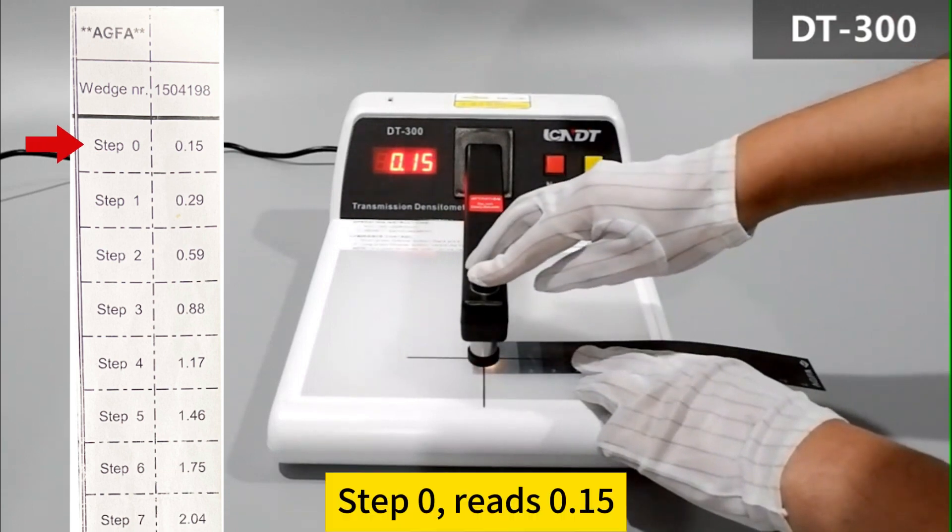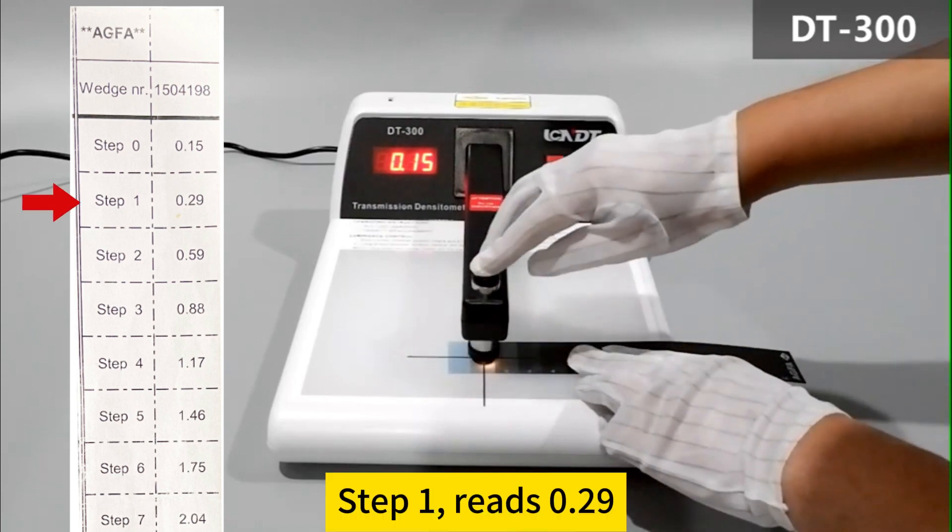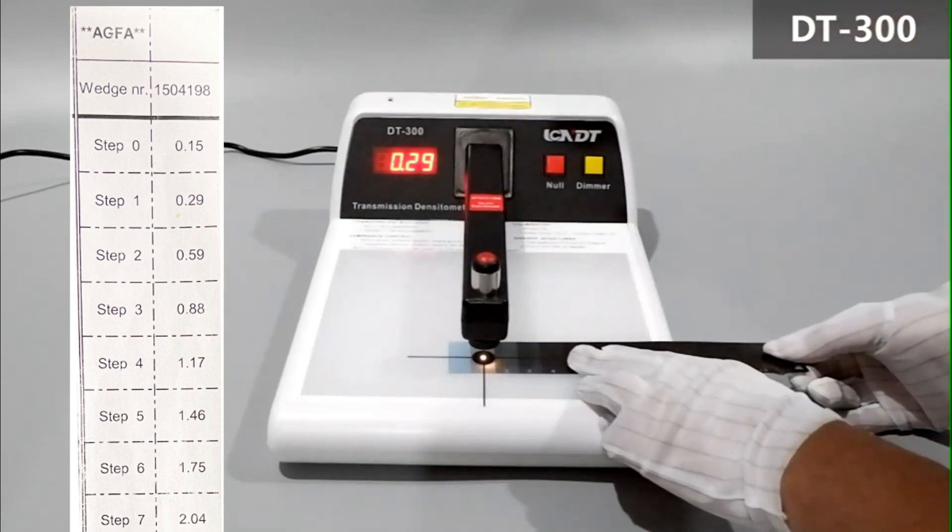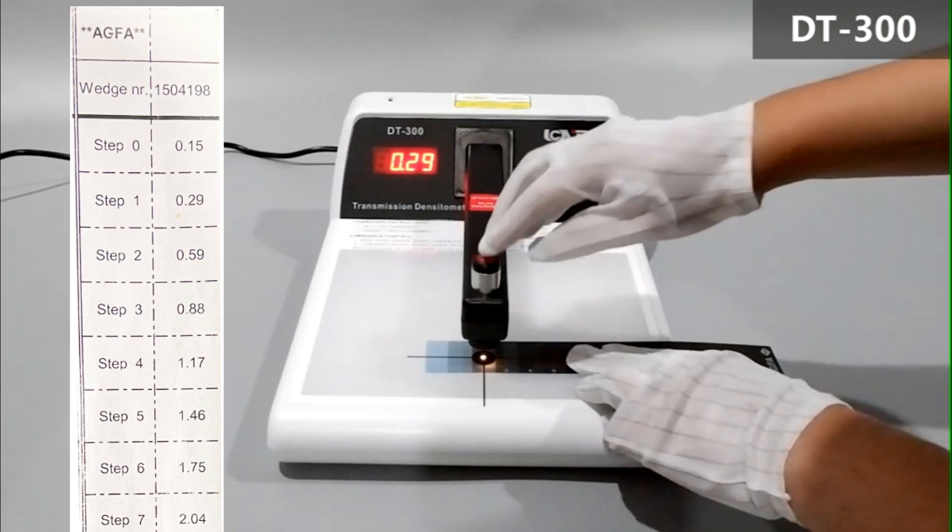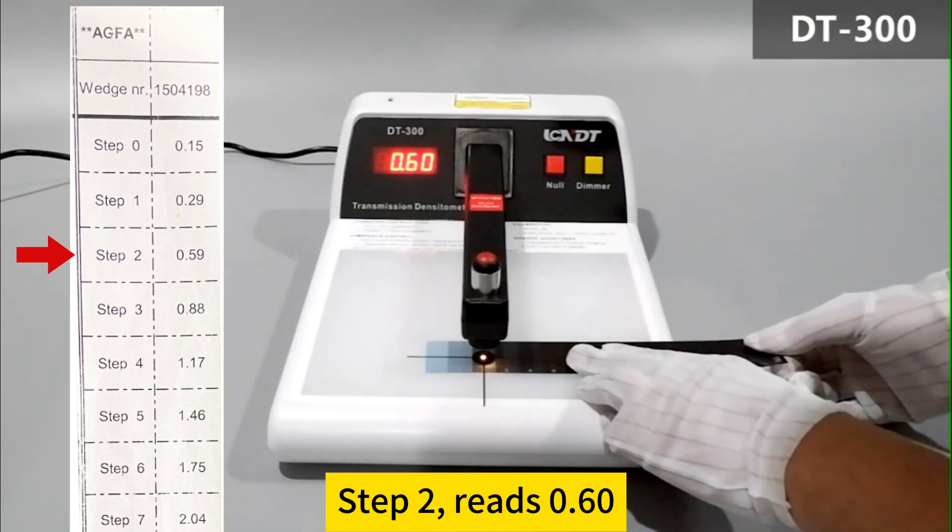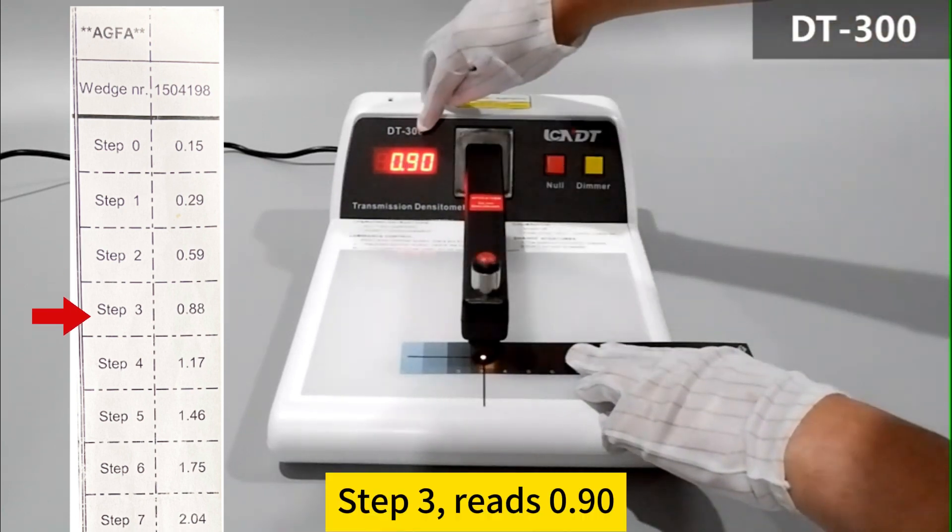Step 0, reads 0.15. Step 1, reads 0.29. Step 2, reads 0.60. Step 3, reads 0.90.